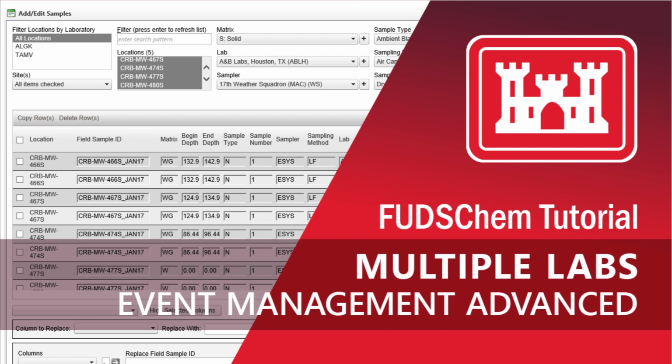This video will go over how to enter sample information into event management when samples are analyzed by more than one lab. For this video, we'll look at an example where each sample is being analyzed for metals at one lab and analyzed for PFAS at another.